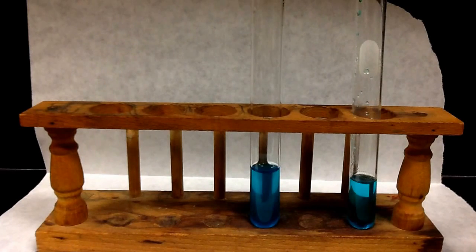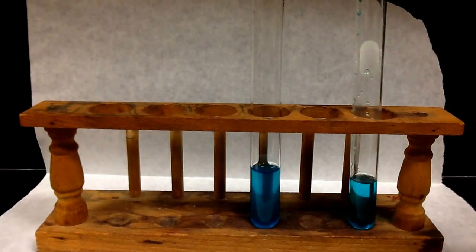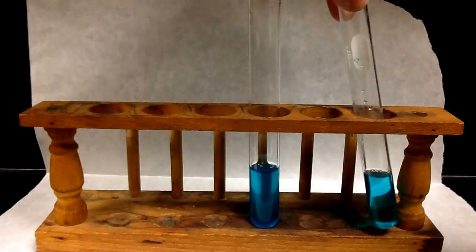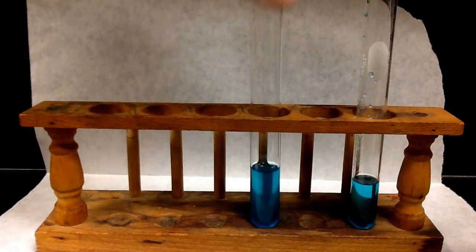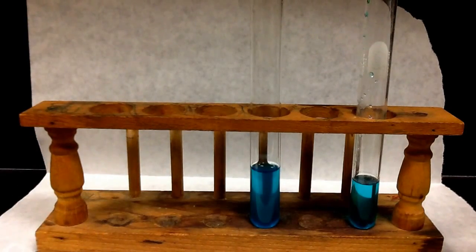So you can see in both these test tubes we've got a copper chloride solution. Hopefully you can tell that it's kind of a green-blue color. And so I'm going to have the test tube on the right as a reference to what the color looks like beforehand.